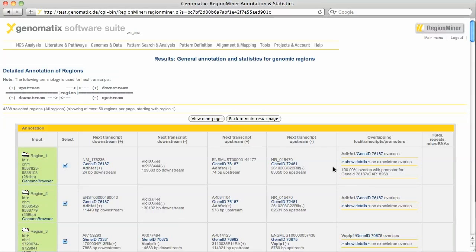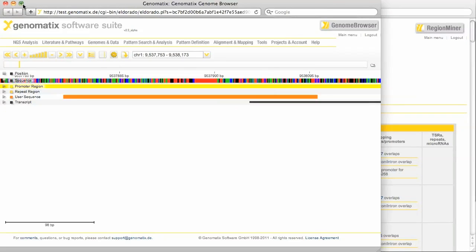With this link you can jump to the region in the genome browser. The selected region is shown as user sequence in orange. This PPAR gamma RXR binding region overlaps with the promoter, which is shown in yellow here.